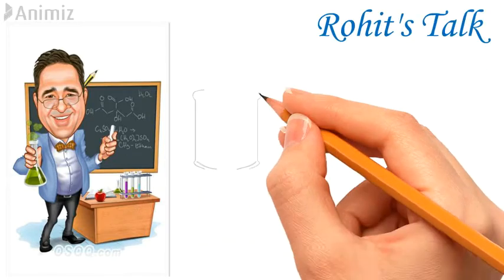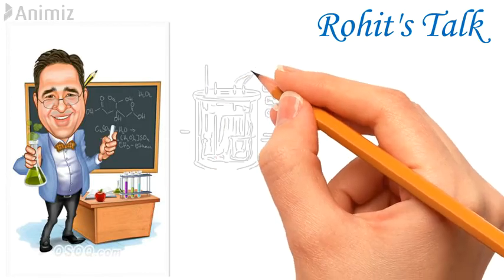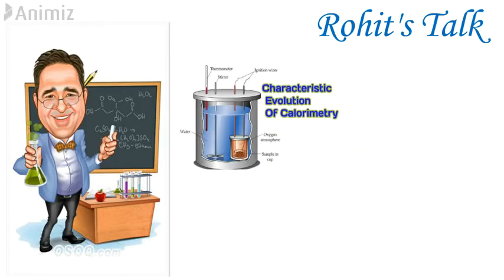In the previous video, we saw what the qualitative properties are which can affect the performance of calorimetry, what is meant by phi factor and how it affects the result of calorimetry, as well as we compared the different calorimetry on the basis of phi factor. In this video, we discuss what the properties and tests are from which we assess the risk during the processing of powder or solid, and of course, the limitations of these tests.